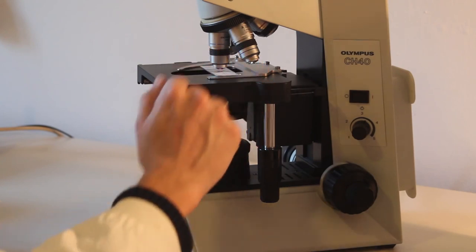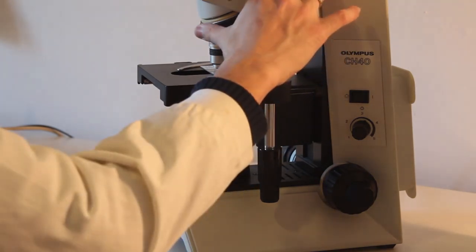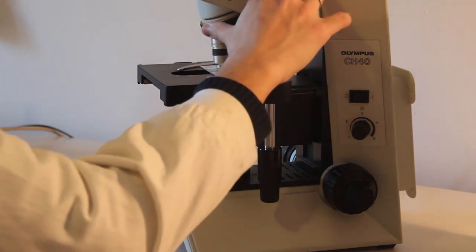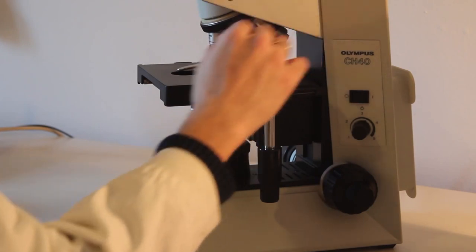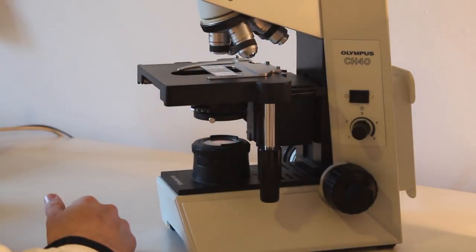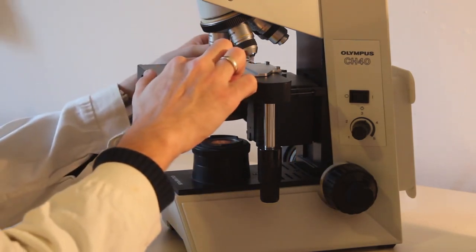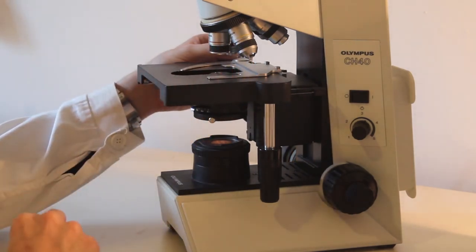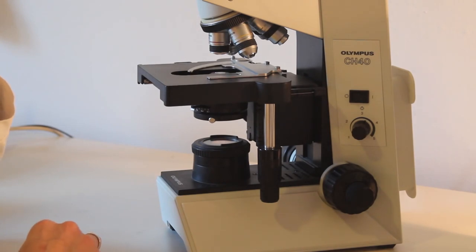Before looking at a different specimen slide, I recommend that you turn the revolver to reposition the low power objective. Then you can remove the slide safely and replace it with a different slide. We are now going to have a look at the same procedure through a camera.